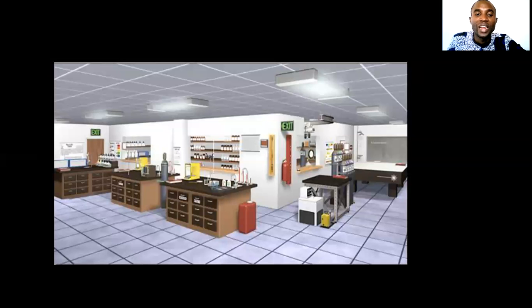This is just a typical example of a chemistry lab, where you see several tables and benches. You can see a fire extinguisher, an exit, and some chemicals here. This is just an example of a chemistry lab. It depends on your school.